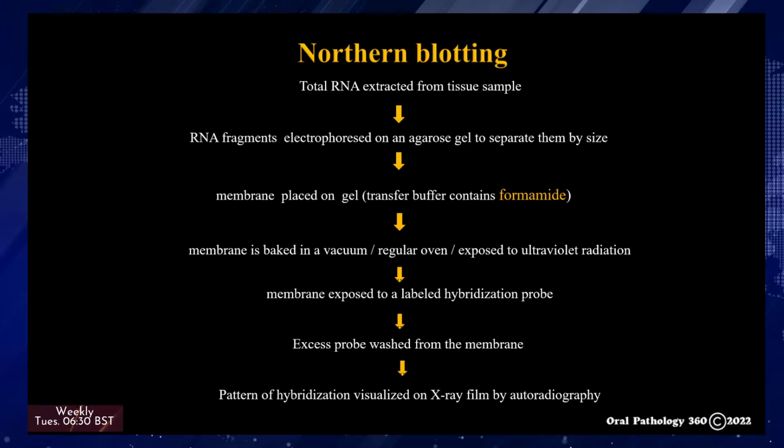Northern blotting. A general blotting procedure starts with the extraction of total RNA from a homogenized tissue sample. RNA samples are then separated by gel electrophoresis. Since the gels are fragile and the probes are unable to enter the matrix, the RNA samples, now separated by size, are transferred to a nylon membrane through a capillary or vacuum blotting system.